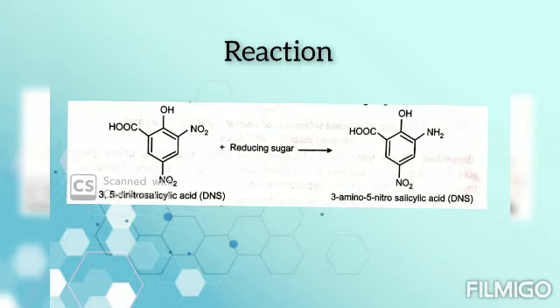This is the reaction in which 3,5-dinitrosalicylic acid, that is DNSA, is reacted with reducing sugar. It gives 3-amino-5-nitrosalicylic acid, that is ANSA.